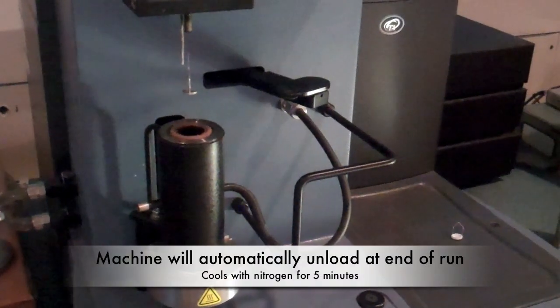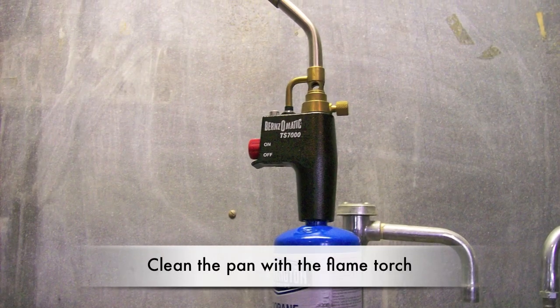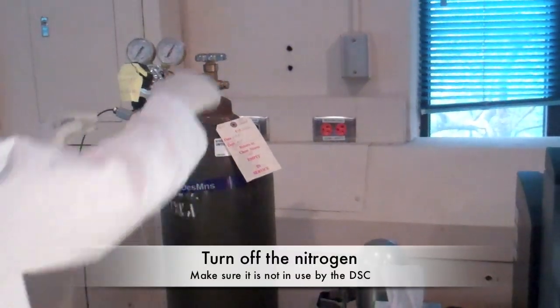At the end of the run, the machine will automatically unload the sample and begin cooling. The machine cools with nitrogen for approximately 5 minutes. Clean the pan with the flame torch to eliminate any residue. Then turn off the nitrogen, making sure the DSC is not currently using the nitrogen.